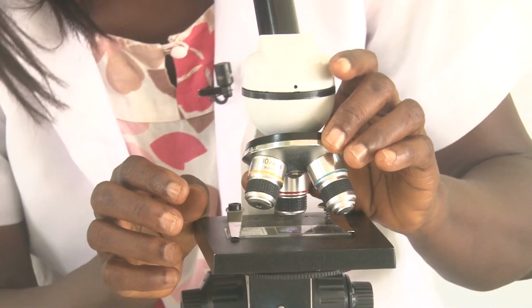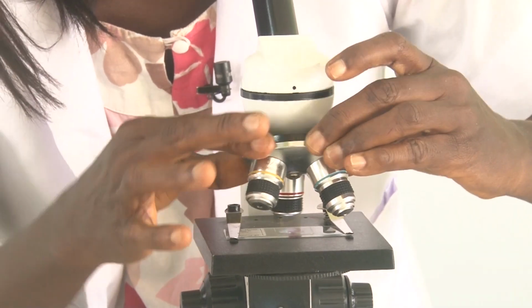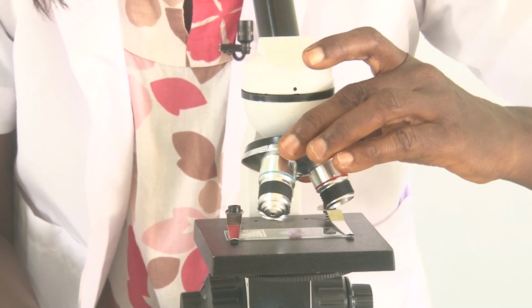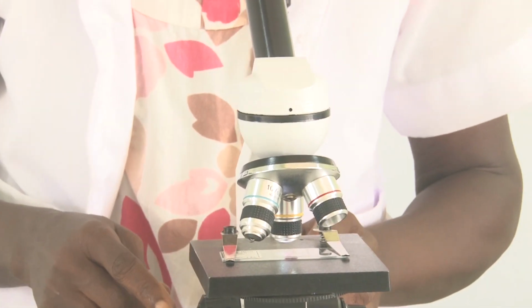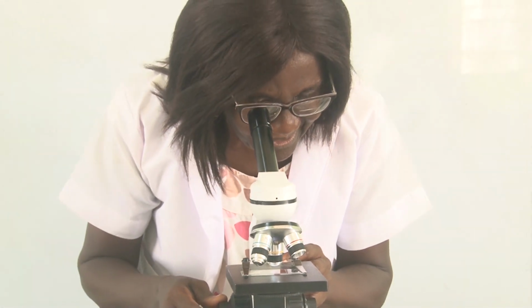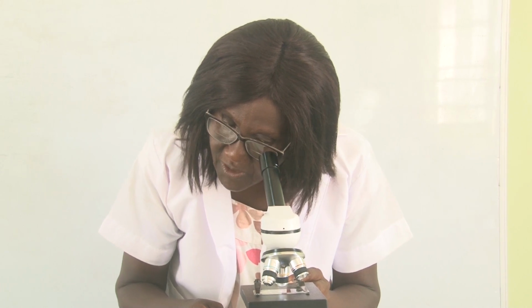So with the revolving nose piece, we turn the specimen into high power. We hear a click. Good. So with high power, you only use the fine adjustment to look at the high power image well. Very neat image down there. Good. Now this image is under high power.